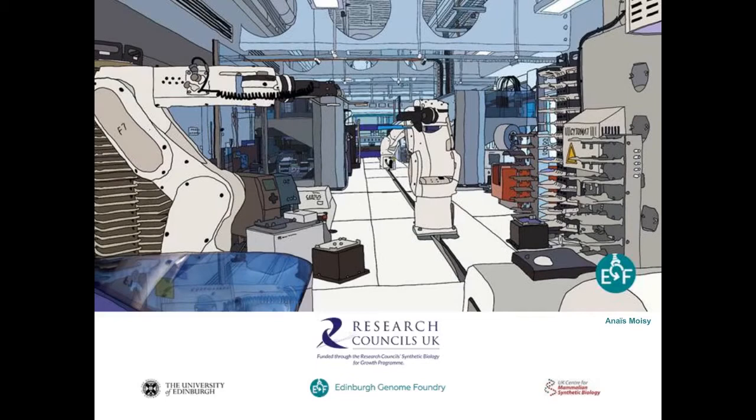Yeah, so again, it's a fairly variable number. The success rate for the Golden Gate assembly method that I described in the webinar starts off at about 90% for a small number of parts, around 6. And obviously, the greater the number of parts you have, the lower the success rate. That success rate drops to about 40-something% when you have a highly complex assembly, which is about 12, 20 parts. And the number of clones that we would have to pick is therefore inversely proportional to the success rate. So we would typically pick anywhere between 6 to 12 colonies per construct to be fairly confident that we would have at least one good one.